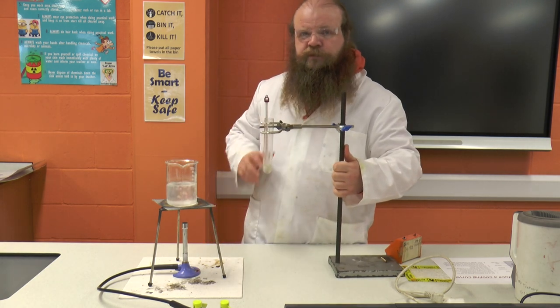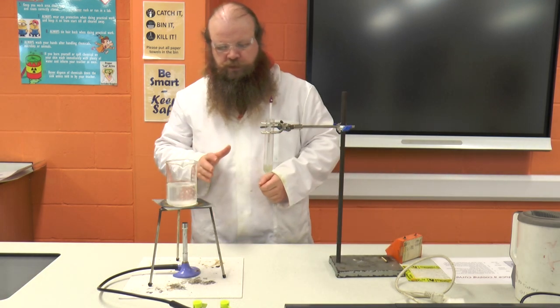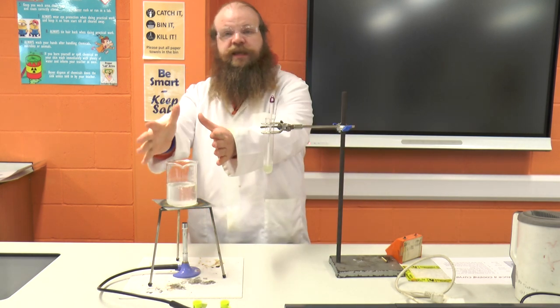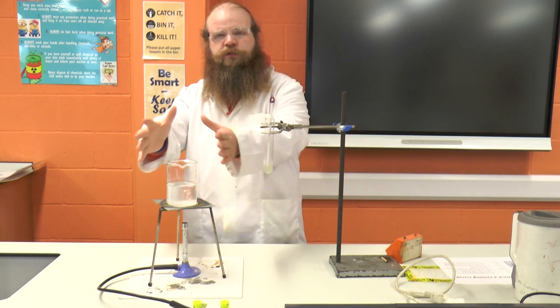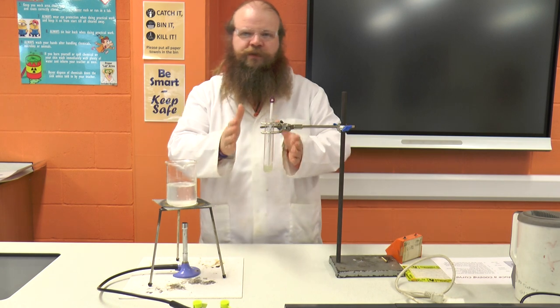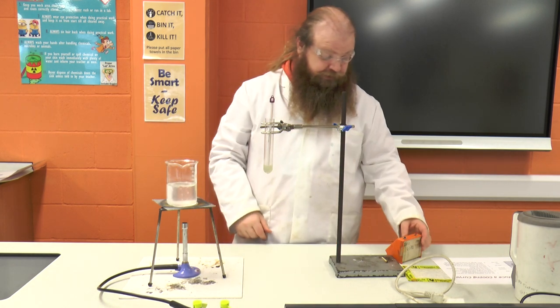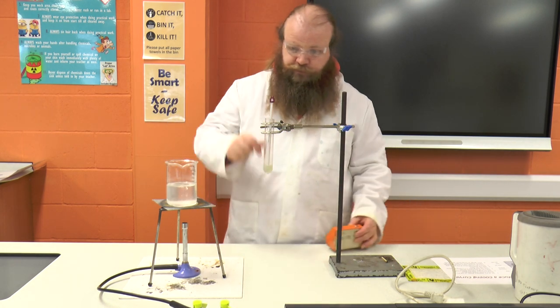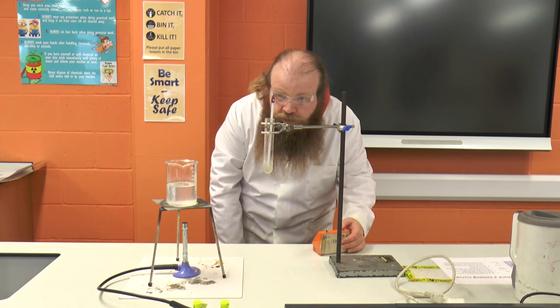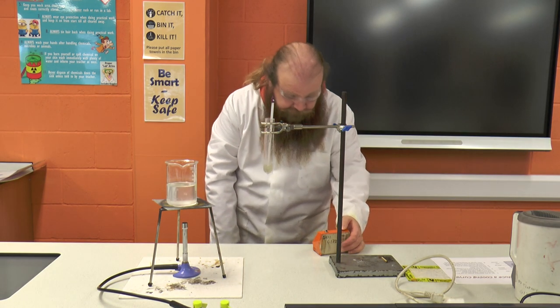The reason we're doing this is that we don't want the heat from the hot water and the steam to affect the rate of cooling of our stearic acid. So we're going to take an initial reading from our thermometer, which in this case is 84 degrees.